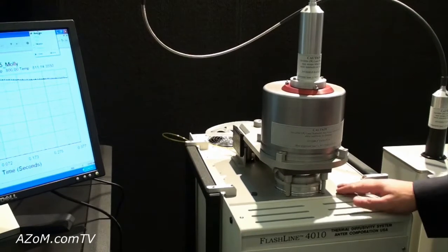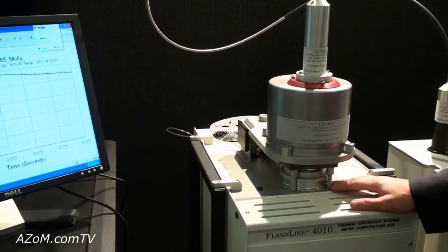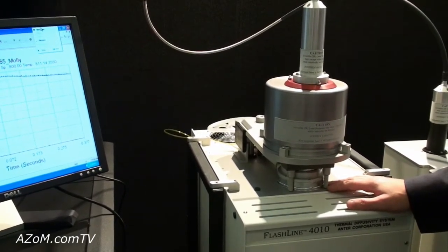Once you have the specific heat, you would input the density and you'll have the thermal conductivity of your material.